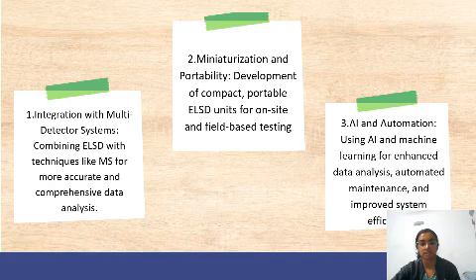Second is miniaturization and portability: development of compact, portable ELSD units for on-site and field-based testing. Third is AI and automation: using AI and machine learning for enhanced data analysis, automated maintenance and improved system efficiency.